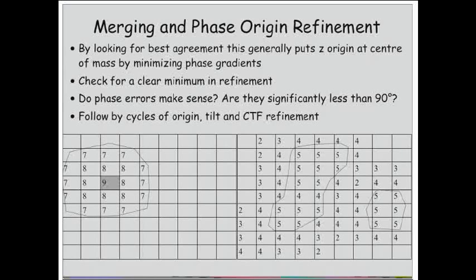Whereas here, it's not quite clear what phase shift we should be applying to the image. Nevertheless, this all translates into distances. Yes. So a 360-degree phase shift would be one unit cell.